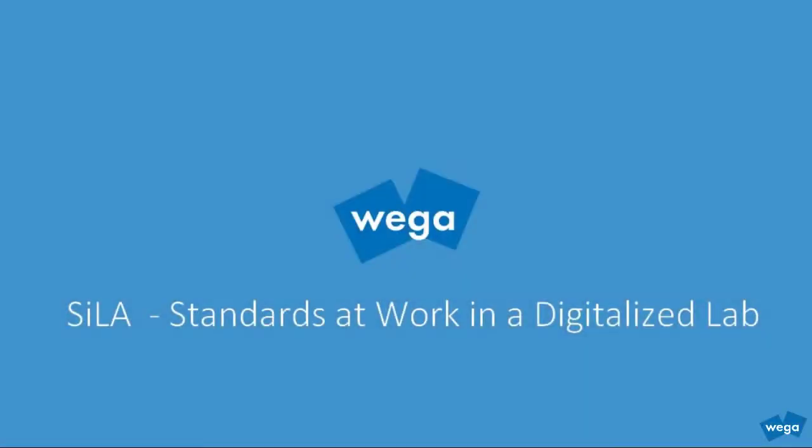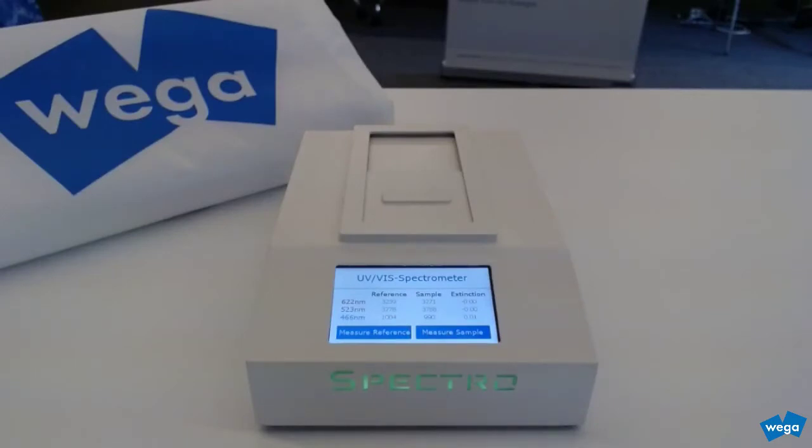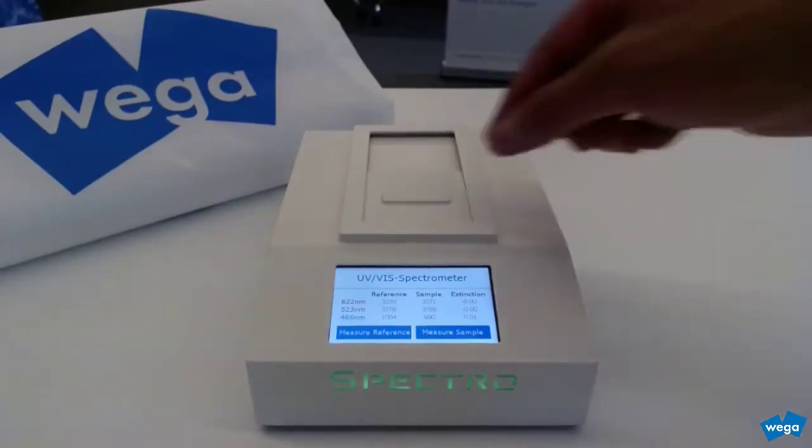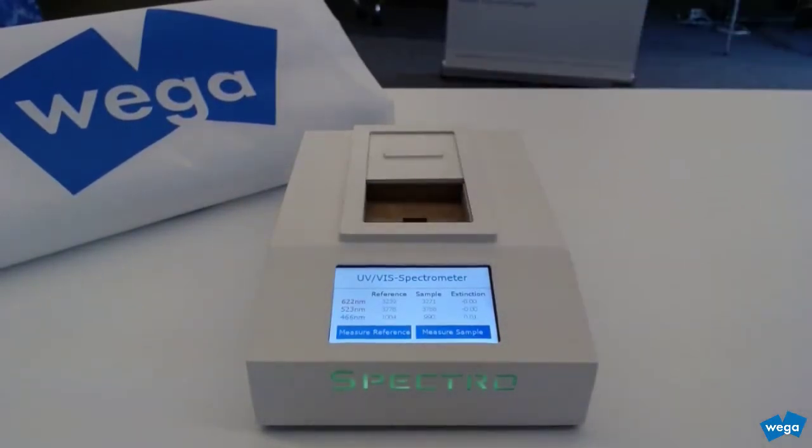Let's discover how a business process model and notation or BPMN workflow can assist the lab technician to measure a sample in the UV-Vis spectrophotometer. The lab technician places the sample to be measured in the UV-Vis spectrophotometer.